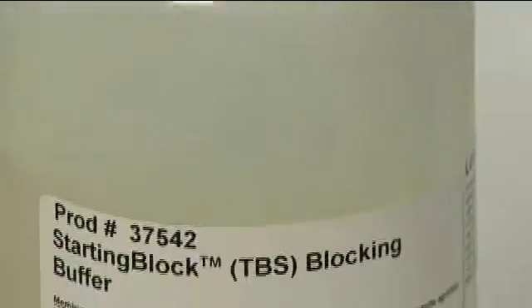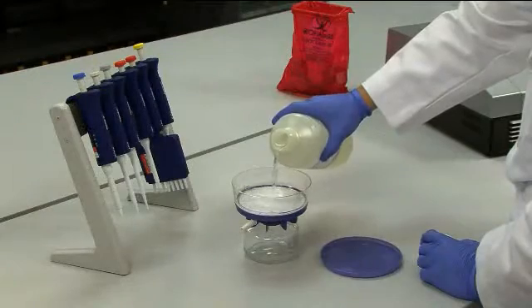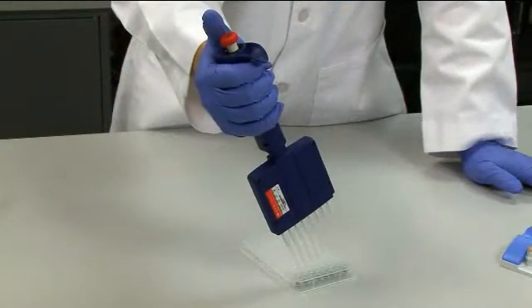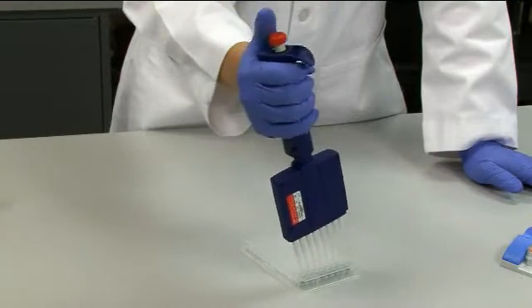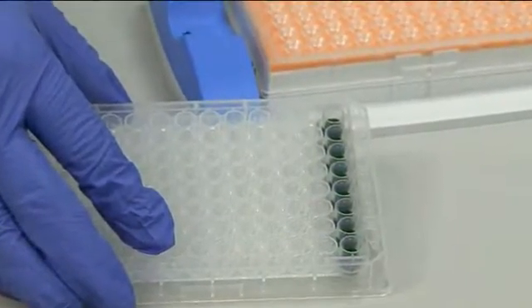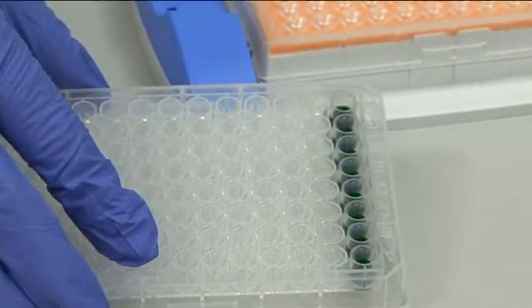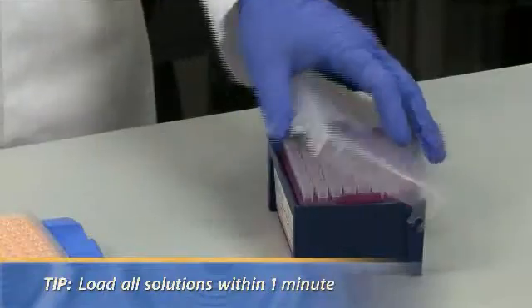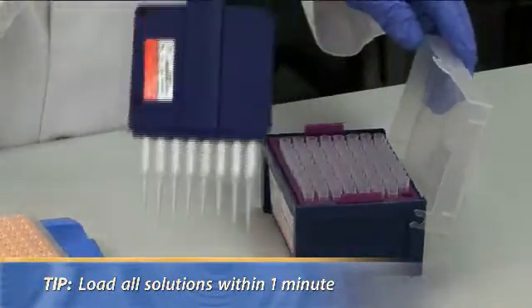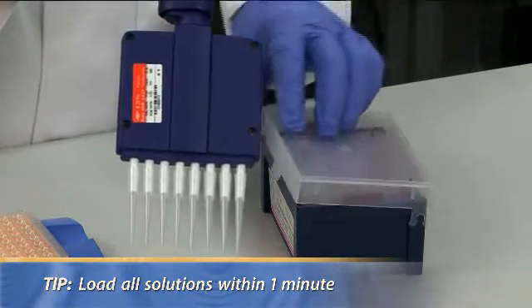Please ensure that all buffers used for preparing assay reagents are filtered using a 0.45 micron filter. If your assay protocol involves multiple samples or different dilutions, please prepare them in a 96-well compatible carrier such as a tube rack or V-bottom 96-well plate. It is necessary that all the solutions for a given assay step are loaded within a one-minute interval. Hence, the use of a multi-channel pipette is strongly recommended.